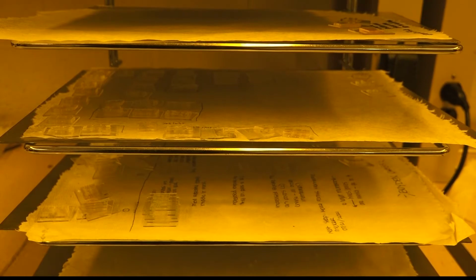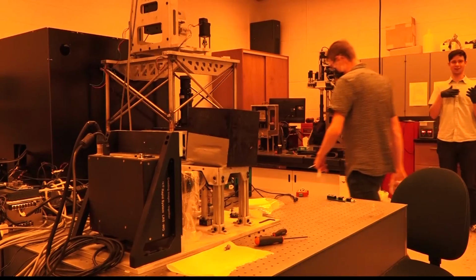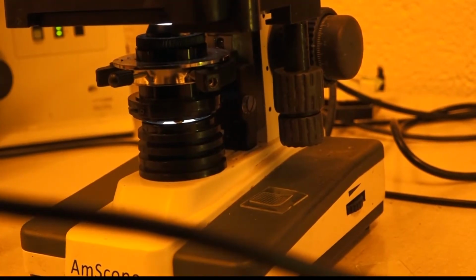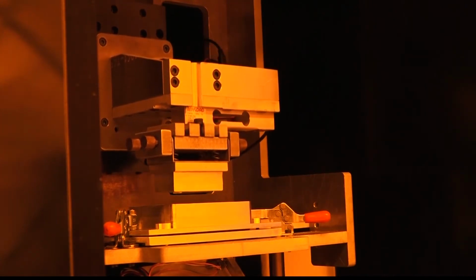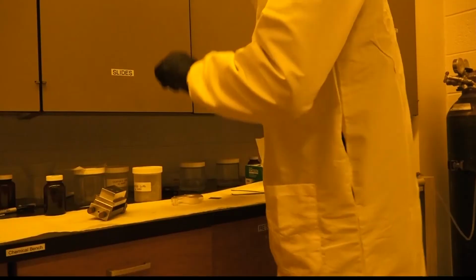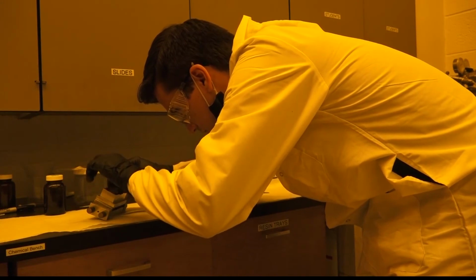It's not the chip itself that is making history, but the process that BYU is taking to manufacture the chips. BYU developed a way to 3D print the chips on micro scales. We're always pushing the boundaries of what's possible. So what we're doing is world leading. The lab is printing pumps and valves that are smaller than 1/10 of the diameter of a human hair.